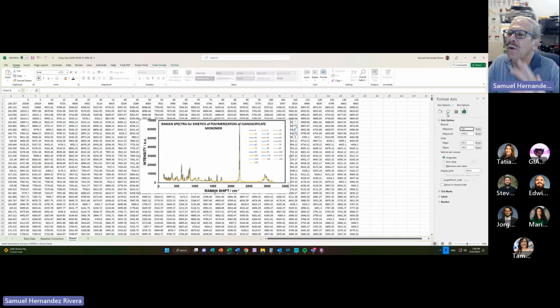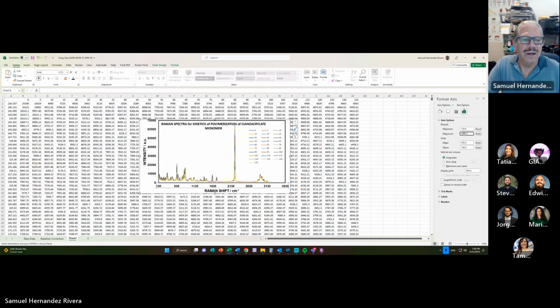Just press 130, but don't do anything else. Now hit 3500, which is the maximum. That way, great. That way, you're in control, not Excel.